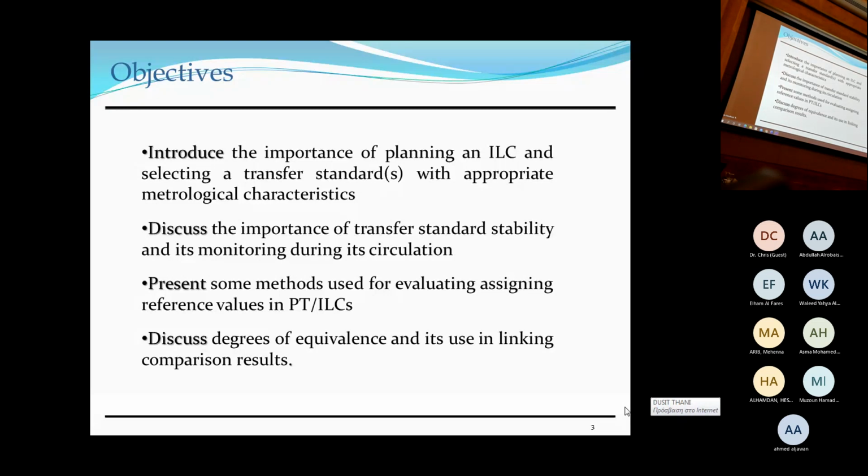So this is the first issue, the selection of the transfer standard. Very important. I have seldom seen an ILC where a transfer standard was used which was adequate for the job. Typically what is done is the lab has a piece of equipment lying around. They say, okay, we'll use this. And they use it as a transfer standard, they measure it, they send it to the reference lab, and that's it. So that's really not a correct way of doing an ILC, and certainly not a PT.